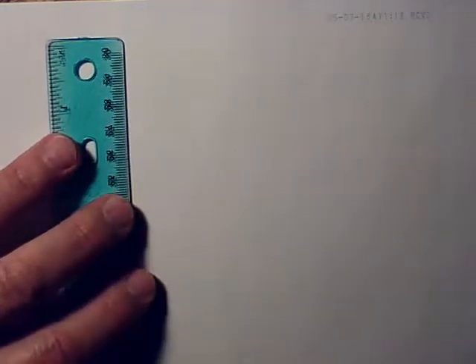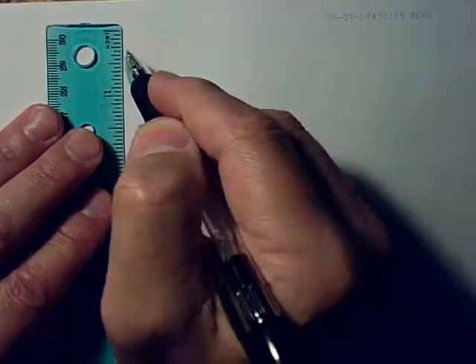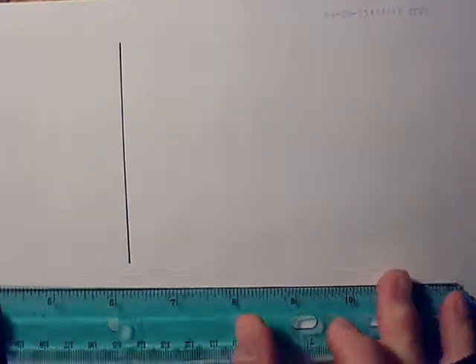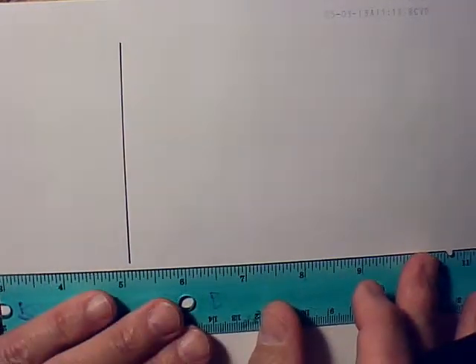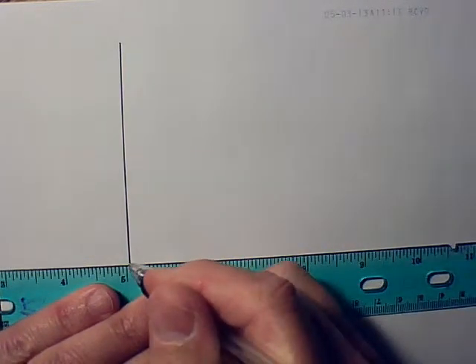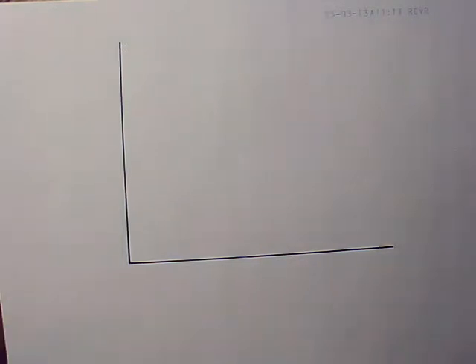Alright, let's talk about what are called pH curves. This is what you're going to be doing in Monday's lab. You're going to be making a graph with a pH curve. This is the first time we've done a lab where I'm not going to ask you to give me a table. I only need the graph. That's because the table is going to be so huge, so much data, that it's not really worth putting down. But you're going to have a graph. On the Vernier Logger Pro, you're going to produce a graph.